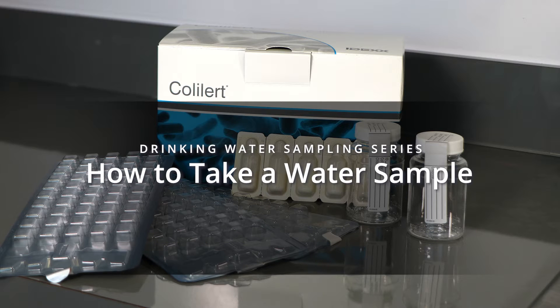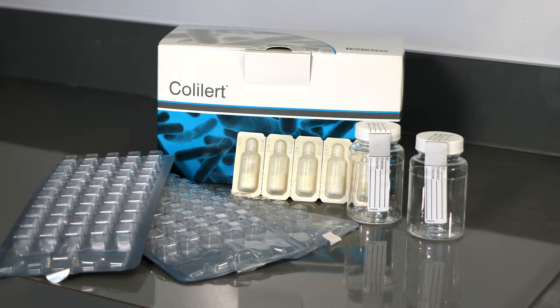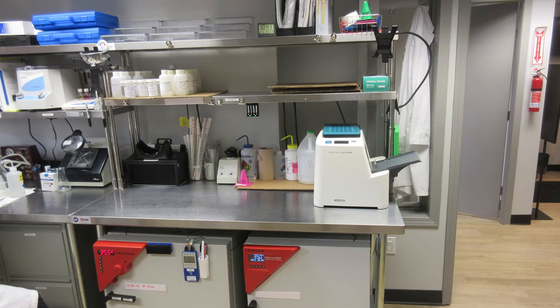Hi, I'm Cori from the First Nations Health Authority Environmental Public Health Team. Today we're going to go over how to take a water sample. Once you have chosen your water sampling locations, you are ready to take your drinking water samples. This video will show you how to properly collect a drinking water sample before processing it.